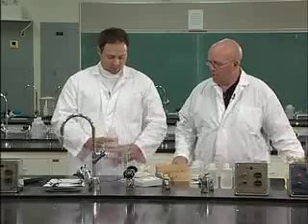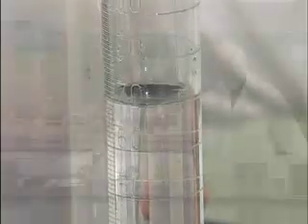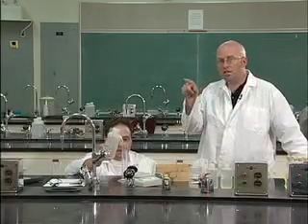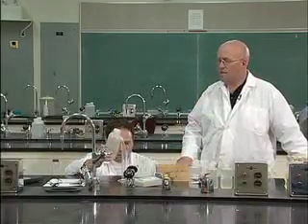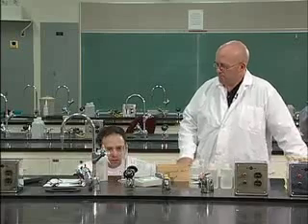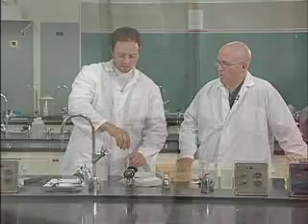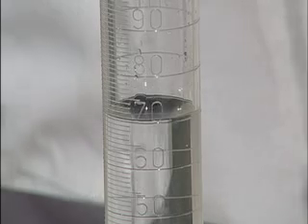Gotcha. Okay. Now when you're measuring out your water, you want to make sure the meniscus lands flat on the 70 mil mark. Meniscus, remember that's in your lab handout there, little pretty picture. I drew that picture, one of them anyway. So look at that for meniscus. Okay, and so when you get down to the meniscus resting on the 70 milliliter mark, that's when you can start to measure your volume.